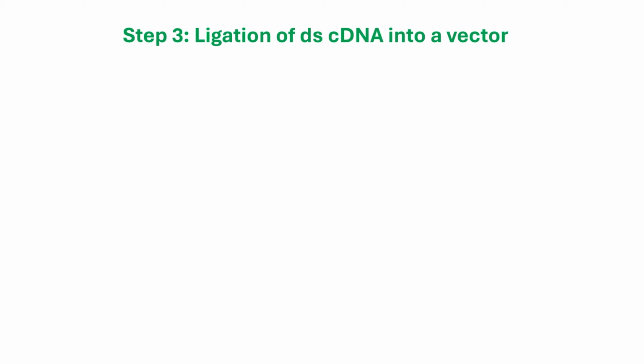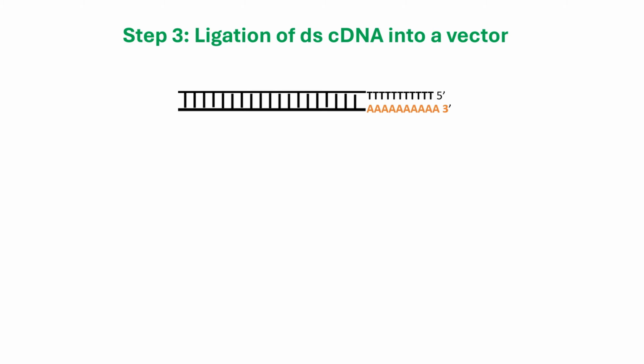construction. Before we continue with the library construction, we need to create our clones. The clone creation involves ligation of our insert, which is the cDNA molecule, with a vector that is a plasmid or any other form of vector, like a bacterial artificial chromosome or maybe a YAC vector. Now, let's look at our cDNA molecule that we are going to ligate with the vector.